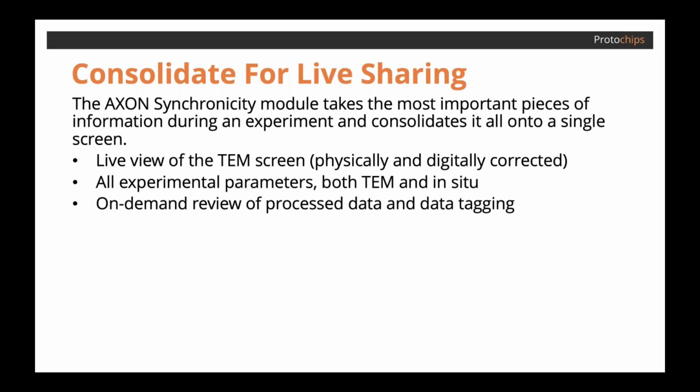And the operator is able to do an on-demand live review of everything captured at any point in time, which would give the audience a nice high-level glance of what has been accomplished in the experiment, making it easier to decide on the next steps while the session is in progress.